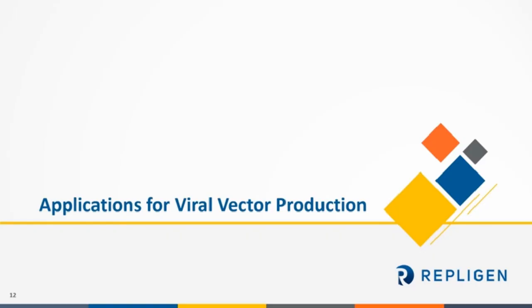Now we'll talk a little bit about viral vector production as well as some other gene therapy related applications based off some testing and studies we've done internally and with collaborative customers.